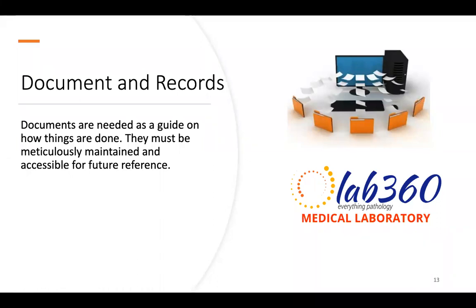Speaking of document control, these are guides that help us in the way we do things. Within a laboratory system, reproducibility is the order of the day. Now, for you to be able to reproduce a process accurately all the time, there must be a document to be referred to. So within LAB360, we've got documents we work with to ensure every personnel is at par with our system. It's just like an eatery.